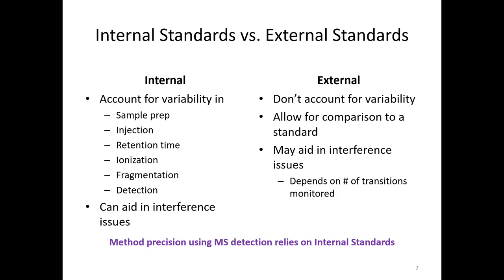So if you are able to include it early on, like, if you dream big dreams and think about when you go and have your blood sample, maybe there's something in the vacutainer. How awesome would that be? Heavy labeled peptides that are already there, heavy labeled proteins that are already there. Or better yet, before you get your blood sample, the day before, you drink something that heavy labels all your proteins, right? I mean, who knows? Maybe one day we could get there. They do it in rats, right?